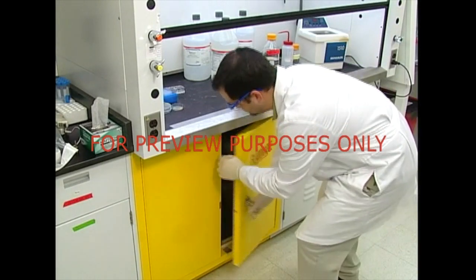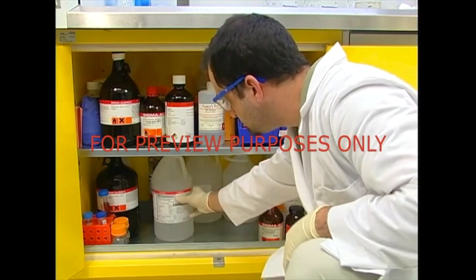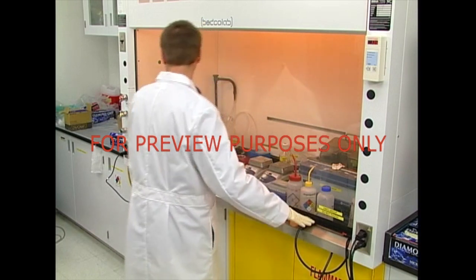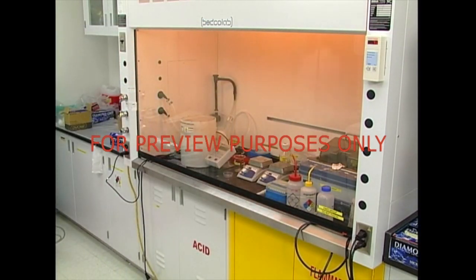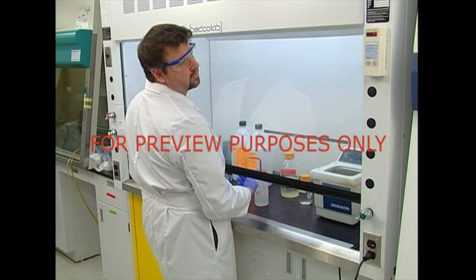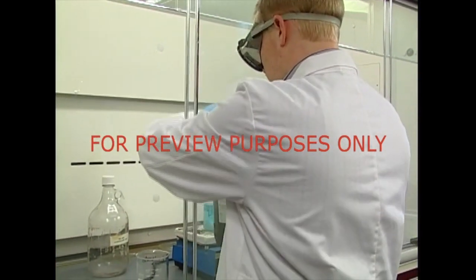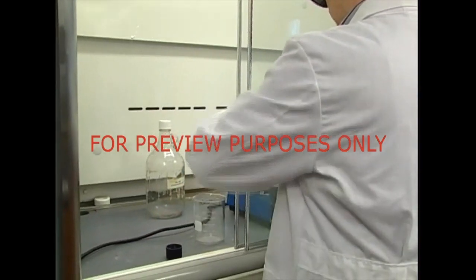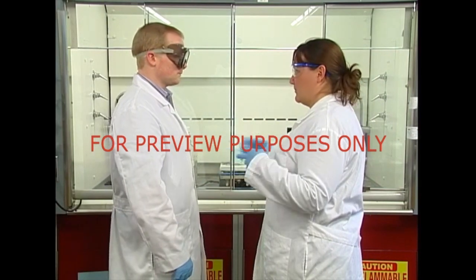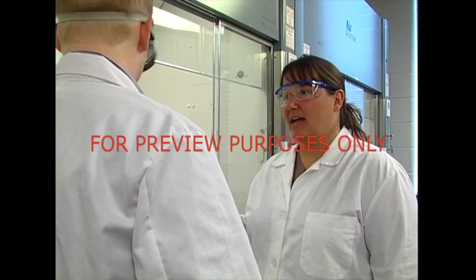Additionally, chemicals that are stored inside a hood can make an incident such as a spill or fire even worse. So if you're not actively working with a chemical, put it in its normal storage space. You should also keep the sash closed as much as possible when you're not working in your hood. Remember to consult the manufacturer's recommendations, and pay attention to the hood's own air monitors — they'll warn you when the airflow through the hood isn't strong enough to contain the hazards within it. It's important to be careful about how you move when you're in front of a hood. Even face velocities of 100 linear feet per minute can easily be disrupted by rapidly removing your arms from inside a hood. Even just walking by the hood face can cause problems.